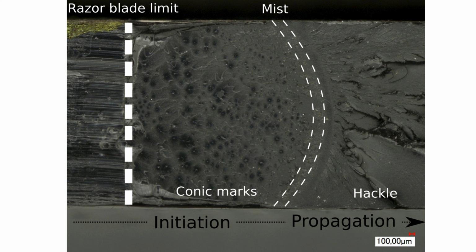Fracture mechanism. The fracture surface can be analyzed by optical and electron microscopy in different zones, initiation, propagation, and arrest, in order to propose cracking scenarios related to the microstructure of semicrystalline polymer. In the arrest zone, the microcracks developed upstream continue to propagate in different directions.